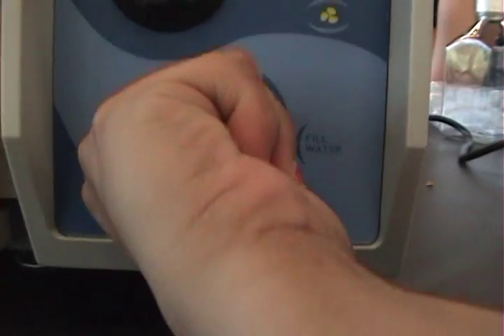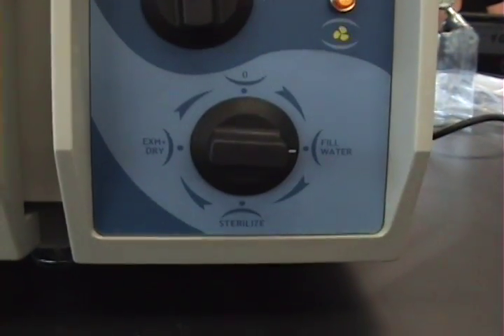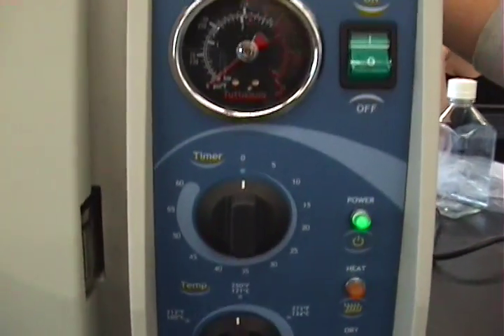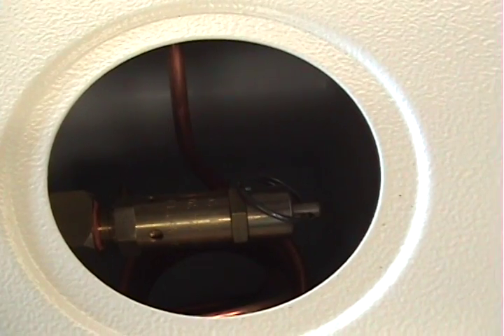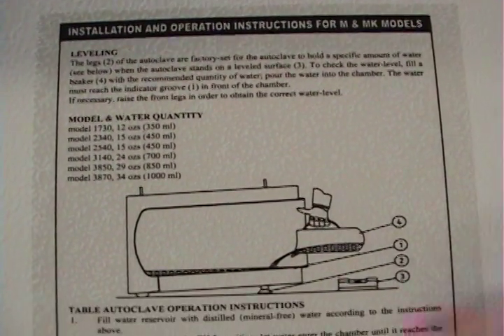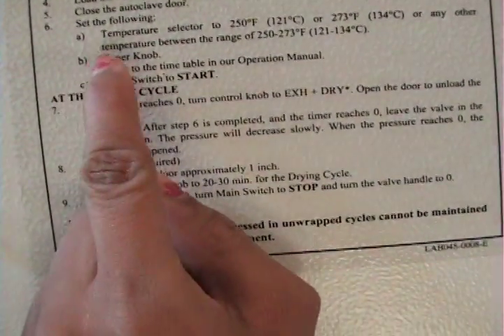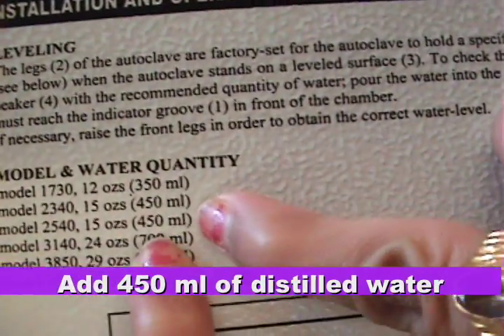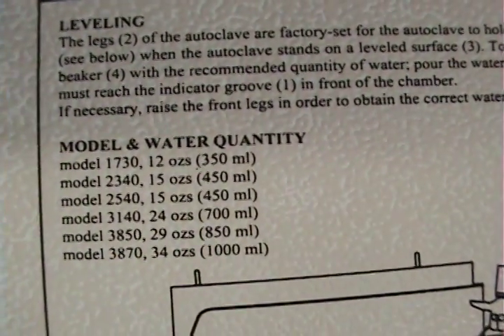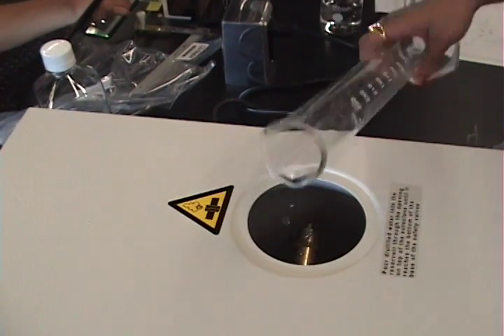Move the knob to fill water — it should click. This is the reservoir where you will put the distilled water. Reference the side column where it lists the amount of water that should go into the autoclave; other information is also listed there. Add 450 ml of distilled water and pour it into the reservoir after measuring it.